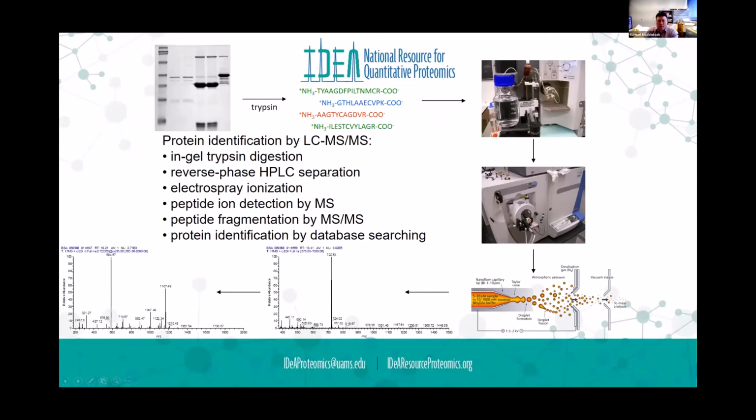So that's one important way that we deal with complexity in proteomics in a lot of cases. With the data independent methods that we've seen a little bit of, that's becoming less of a problem. In that case, we're able to use sophisticated data analysis and database preparation to get around the need in a lot of cases to fractionate the samples so extensively.